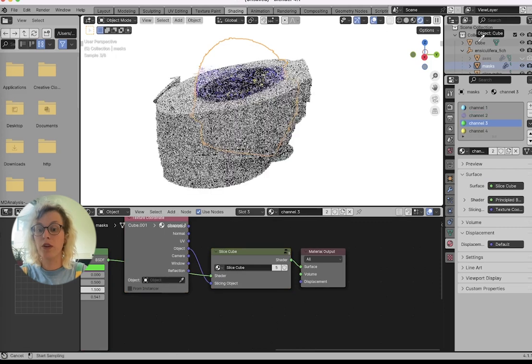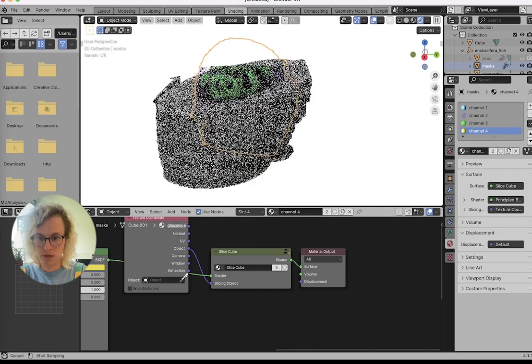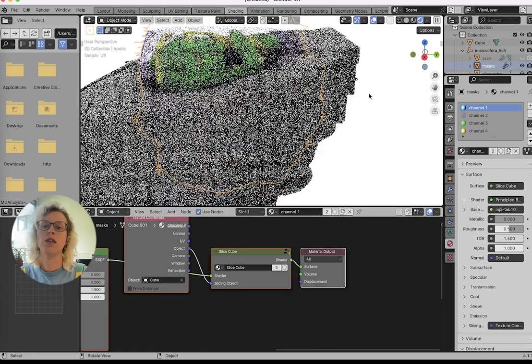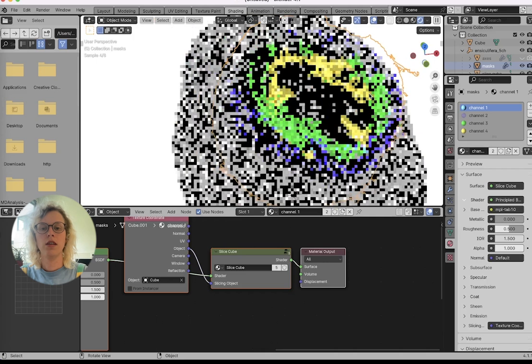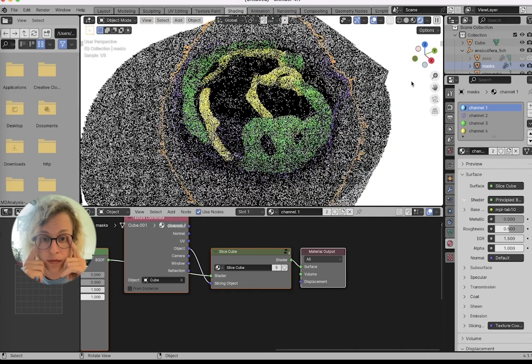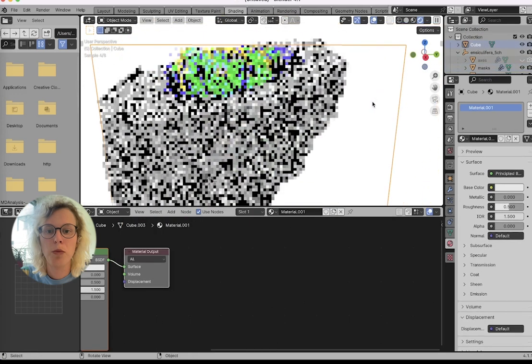You do have to do this for every channel that you want to have affected by it. Let's also do the trichocysts just for later.